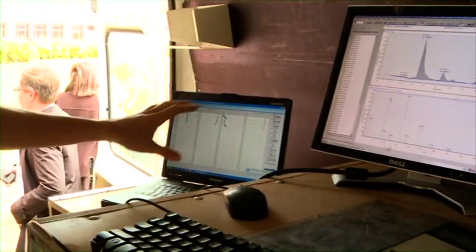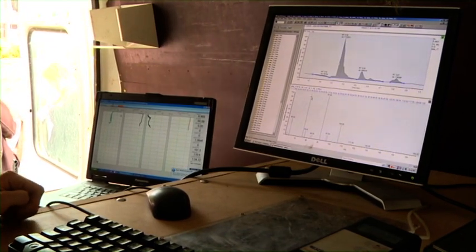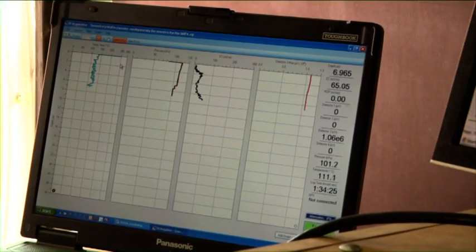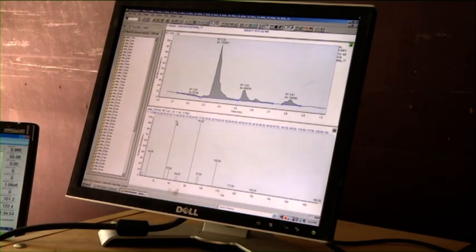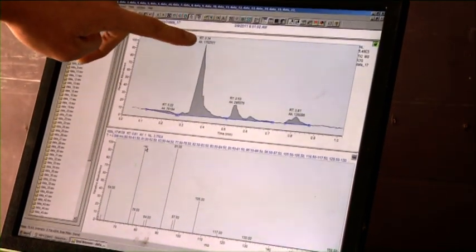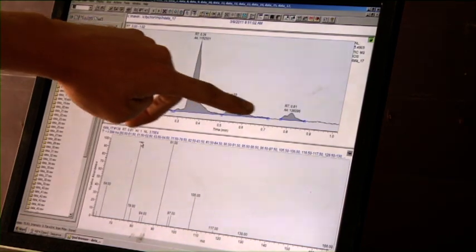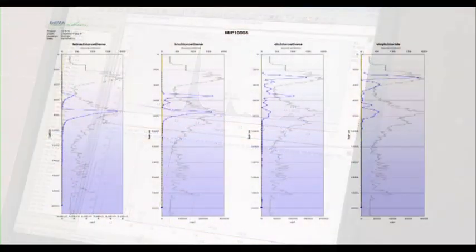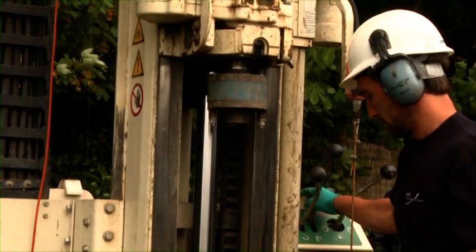With an innovative GC configuration and smart method optimisation, an analysis with very short cycle time has been developed. The system allows for a GC-MS analysis every 30 centimetres without losing probing speed. Field evaluations indicate that the INISA MIP is capable of measuring soil profiles for individual compounds with detection limits near 10 to 20 micrograms per litre.